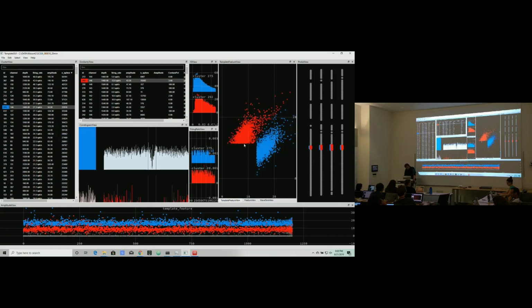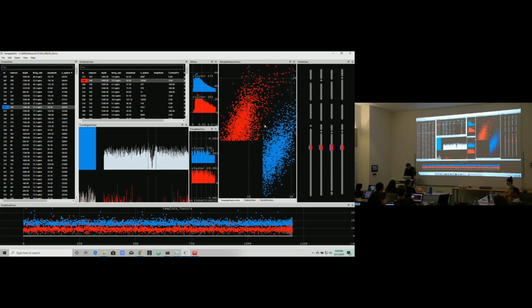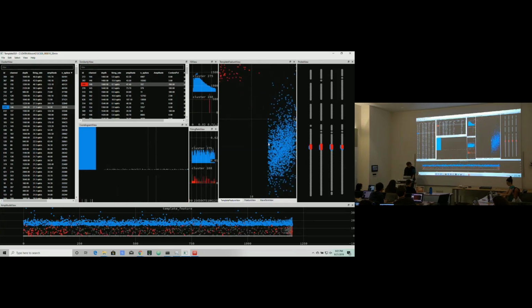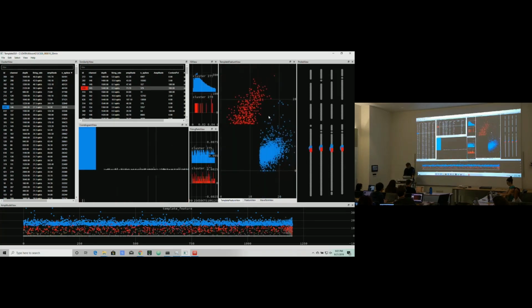It should look like two kind of separated things. But what you do see is there's this little square here. And what that says is that both of these have actually been thresholded with respect to the noise. So they're both kind of small, and the threshold we set, if you remember the 10-4 for the thresholds, has cut these clouds so that we don't get too much contamination from the noise. Okay, good. So you can keep going.